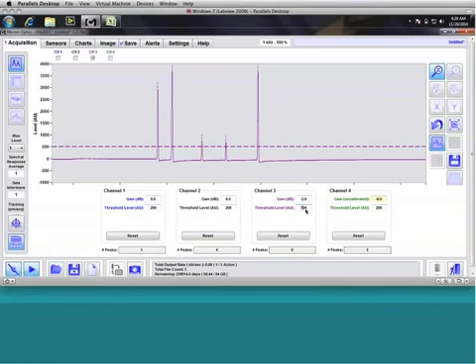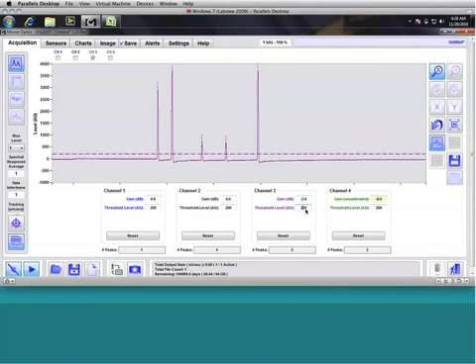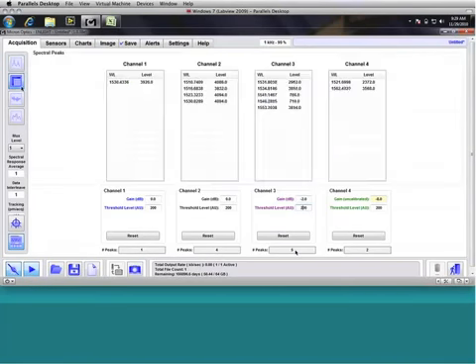And so that's what we're going to do here: restore our threshold to where it was at 200, and you'll see that our number of peaks goes back up to the expected 5, and they are reintroduced into the table for further processing on the subsequent tab.